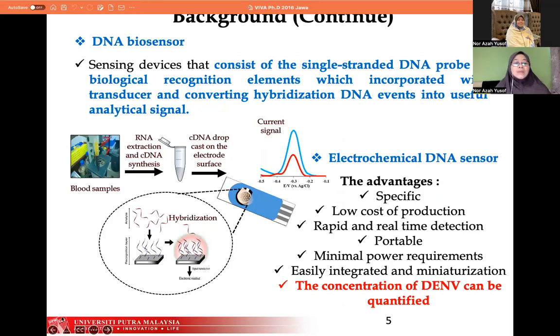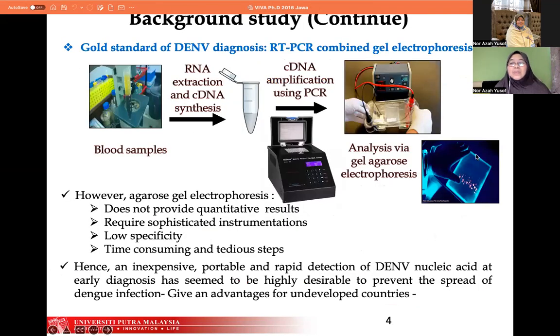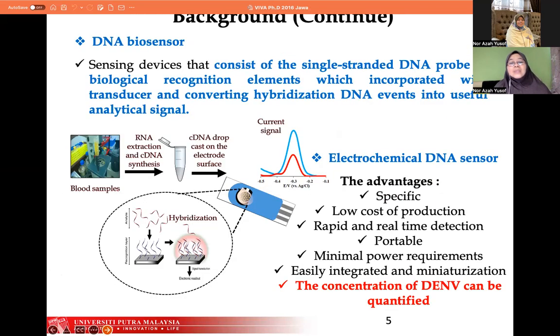at least we can escape the electrophoresis part. But nowadays, of course, we are working on a much more sophisticated biosensor where we can incorporate all this extraction, amplification, all in the biosensor itself. So now it can be done, of course.